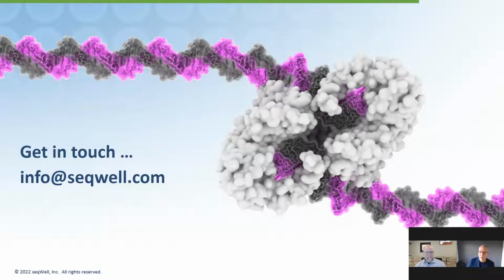Again, thanks for the question. Based on our experience with our products using the transposase, there's certainly a wide range of GC tolerance when we look, for example, at microbial specimens that are as low as 30% GC up to 70% GC.